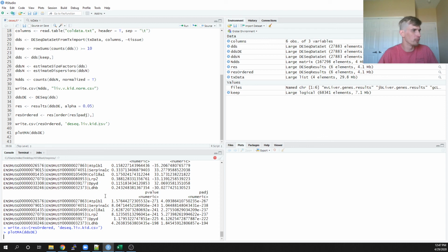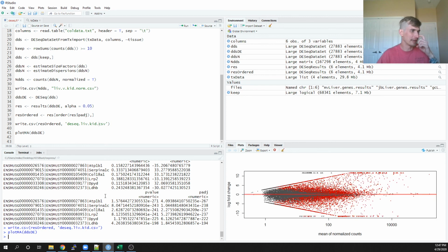But I think whenever I'm done with this dot plot, that'll be it for the day. Because I think that's going through everything of just doing the analysis, not looking at our results. I'll save Friday for visualizing our results. This is the only visualization that I'll actually do today. The rest of it I'll save for Friday, actually visualizing specifics of our matrix.